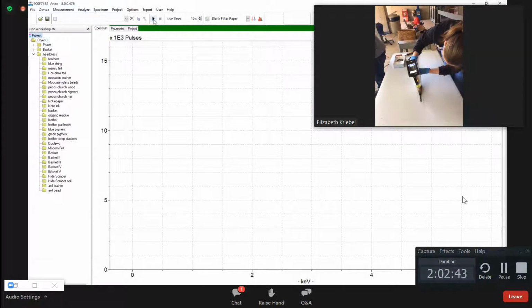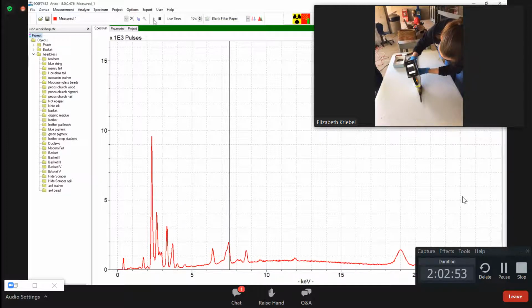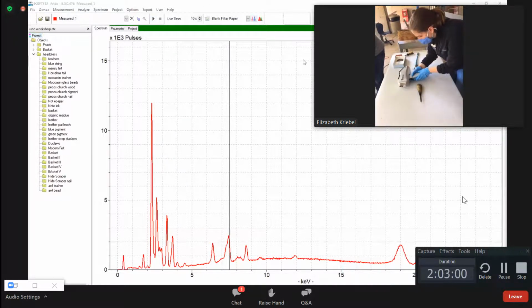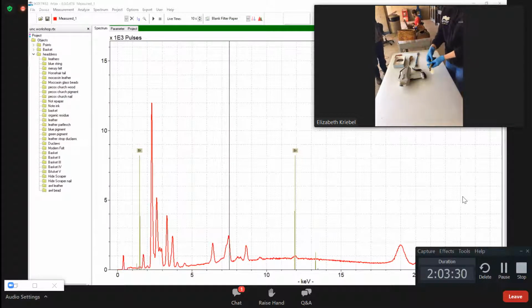All right. Let me know when you're ready. Ready? Okay. Starting. Got it. This one has been salt washed. And we see a little bromine coming along for the ride too. Yep. That would be my interpretation. It's awesome. They're not mutually exclusive though, I don't think. Yeah. But highlighting the bromine, especially since they can have a potentially alternate conclusion. But my guess would be salt washed with bromine coming along for the ride. And then lots of sulfur. So yeah, animal product, not bone. So it's like keratin. I guess keratin is what it is.